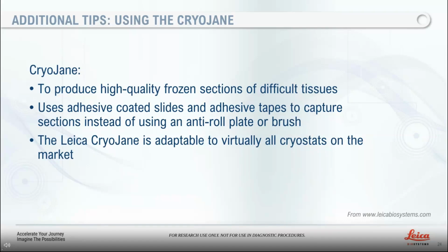There are several videos on YouTube showing how CryoJane has been used. Type CryoJane on the search bar and you will find the videos. Now that we have discussed several hacks and tips about cryosectioning, I believe it is time to compare how these hacks will impact your cryosectioning quality.